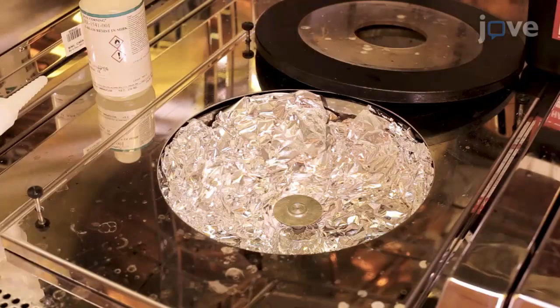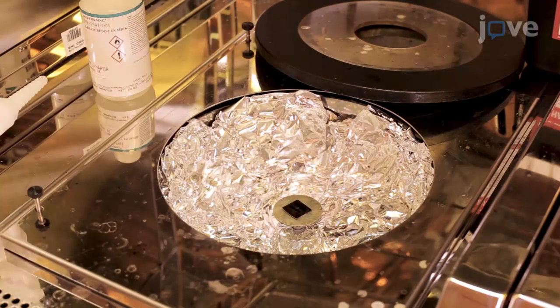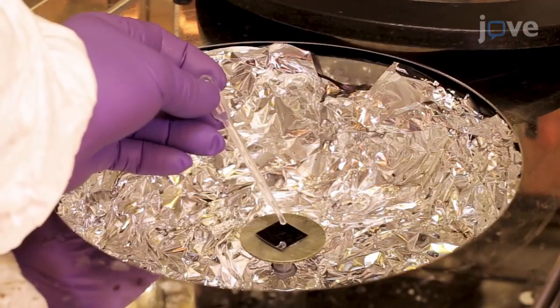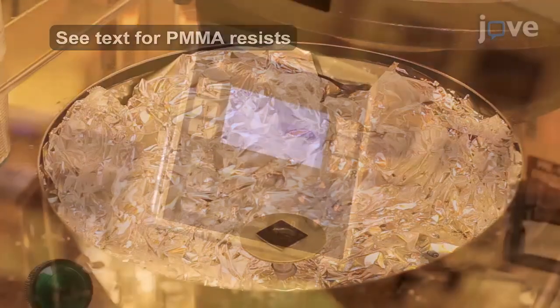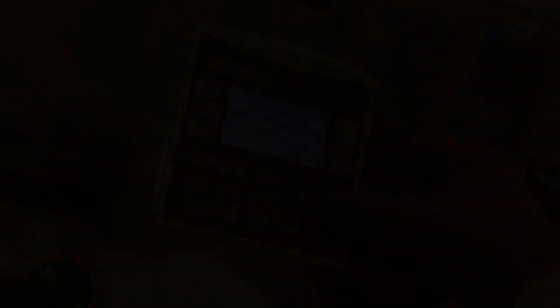To spin coat the HSQ resist, mount the silicon holder on the spinner chuck and align the center of the TEM window approximately with the center of the spinner rotor. Using a pipette, cover the entire TEM window with one drop of HSQ. Depending on the resist used, follow the spin coating and baking parameters shown in the text protocol.